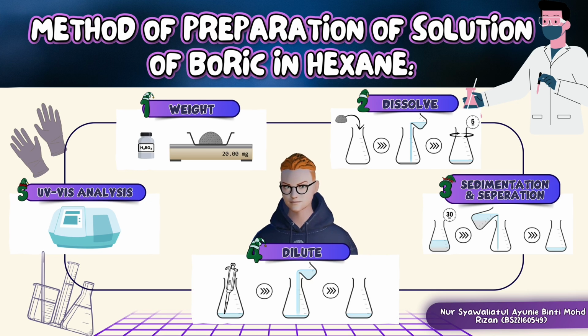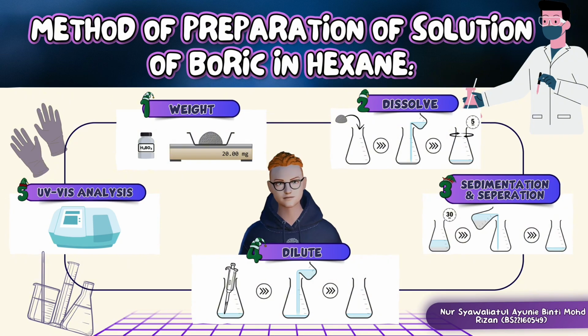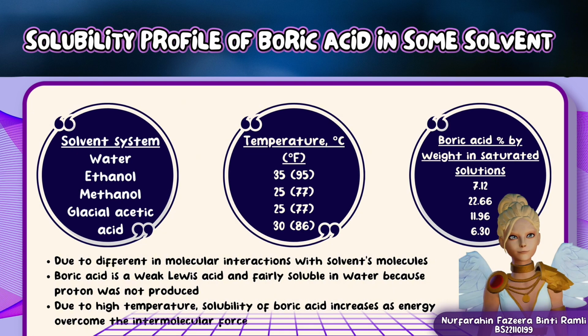For the UV-vis spectrum of boric acid solution in methanol, the data analysis shows clear spectra without any crowding and also shows positive absorbance, with peaks in the range of 200 nm. This is because methanol is an alcoholic solvent, a polar solvent that enables strong hydrogen bonding. Also, methanol contains hydroxyl groups which could bond with the hydroxyl groups of boric acid. Thus, hydrogen bonding between these two could stabilize boric acid in methanol solution.